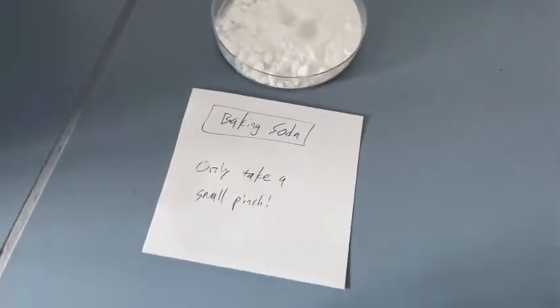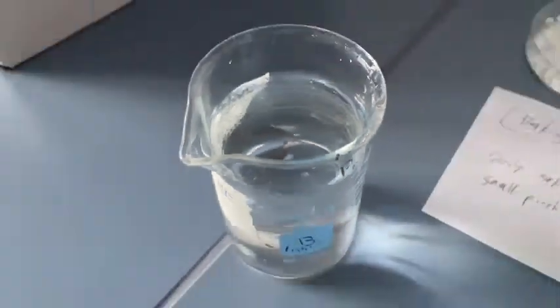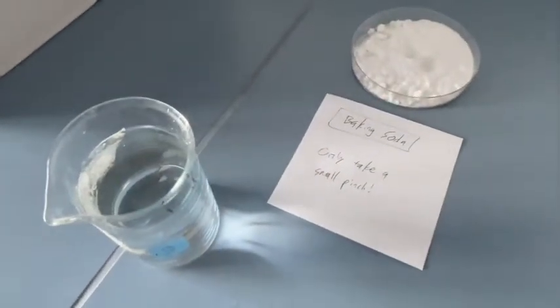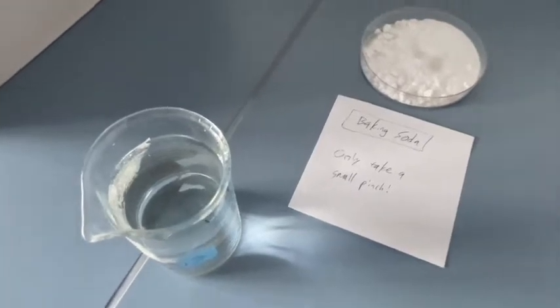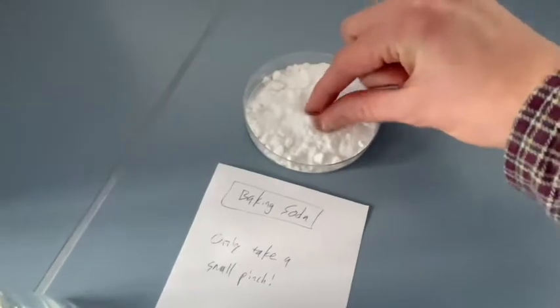Now, students know that photosynthesis requires two reactants, both water, and they know they have that one, but it also needs carbon dioxide. So where is it going to get the carbon dioxide? Well, that's provided by the baking soda. Okay, so I provide that for the students.